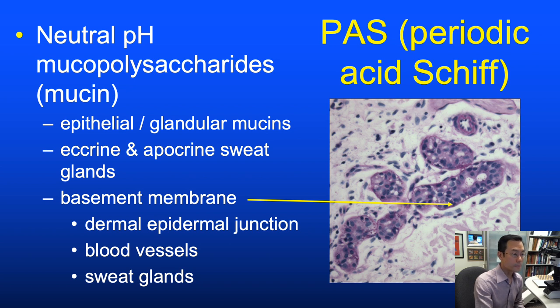These PAS-positive mucins are different from stromal mucins such as those increased in lupus. These are epithelial or glandular mucins seen in sweat glands and basement membranes along the dermal-epidermal junction. The staining color is a magenta pink.